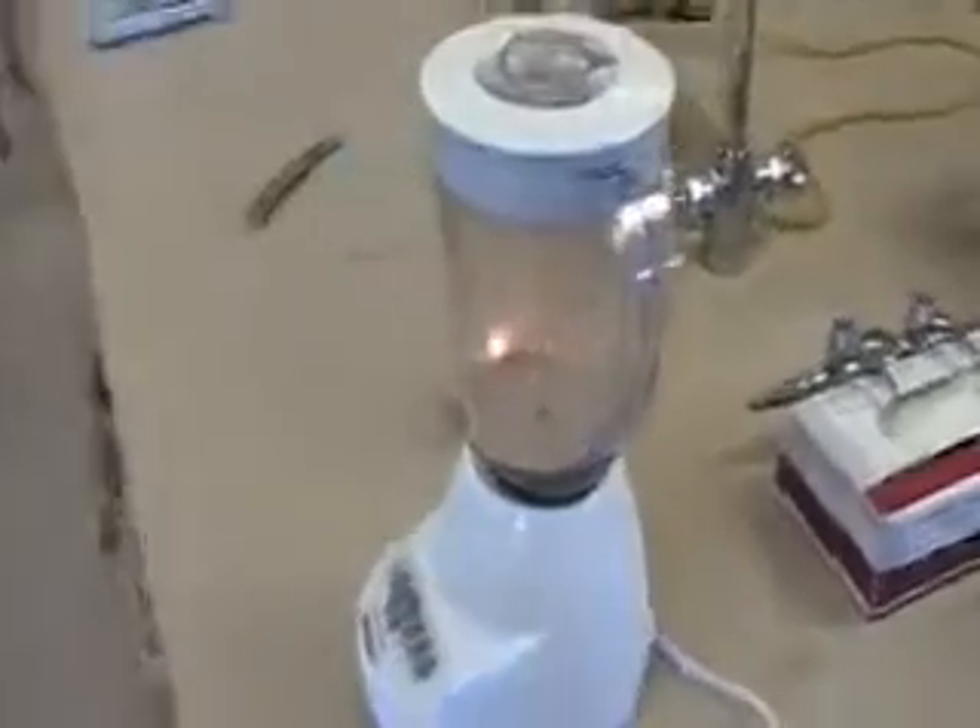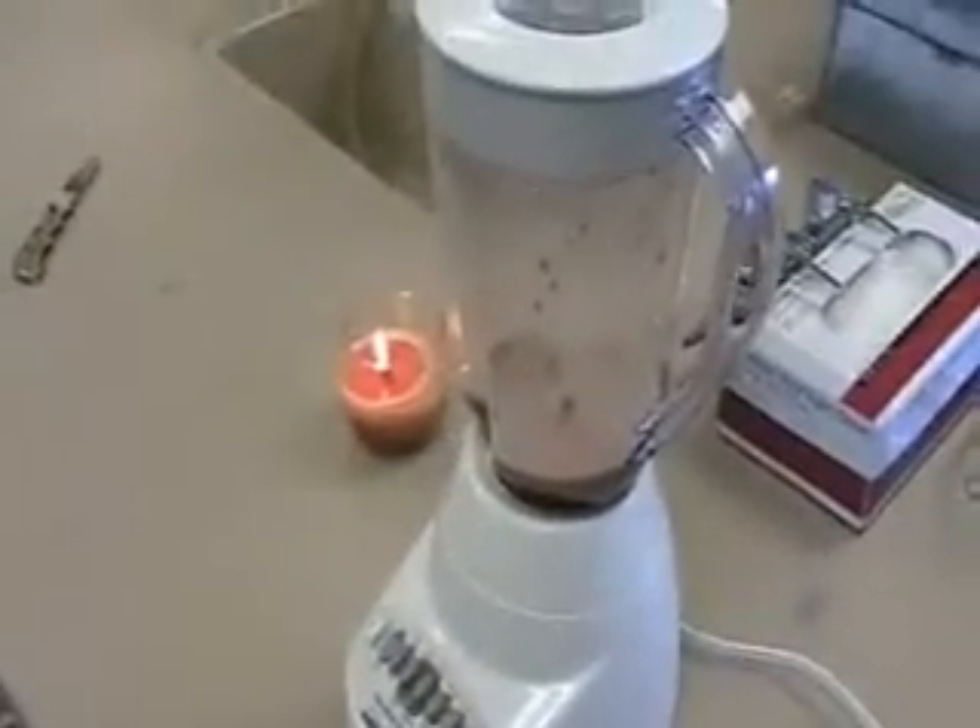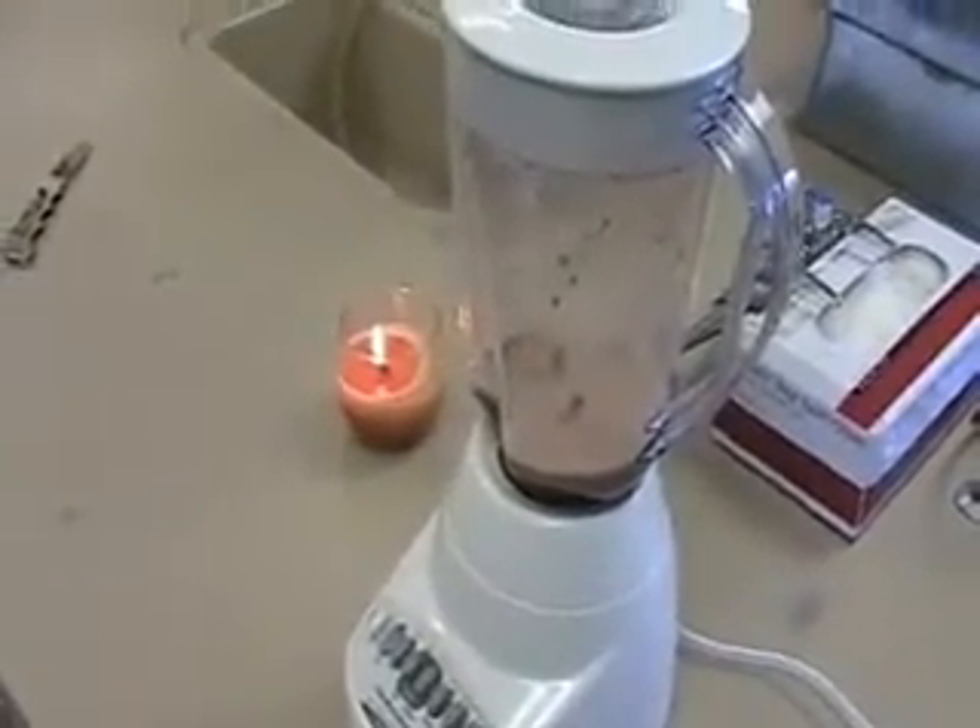Just out of curiosity for the gross-out factor, how are we getting this catalase out of the liver tissue? Putting it in a blender with a little deionized water and mixing it up. It's kind of gross, but that's why the candle's there — especially when you get little bits of tissue and it just splatters everywhere.